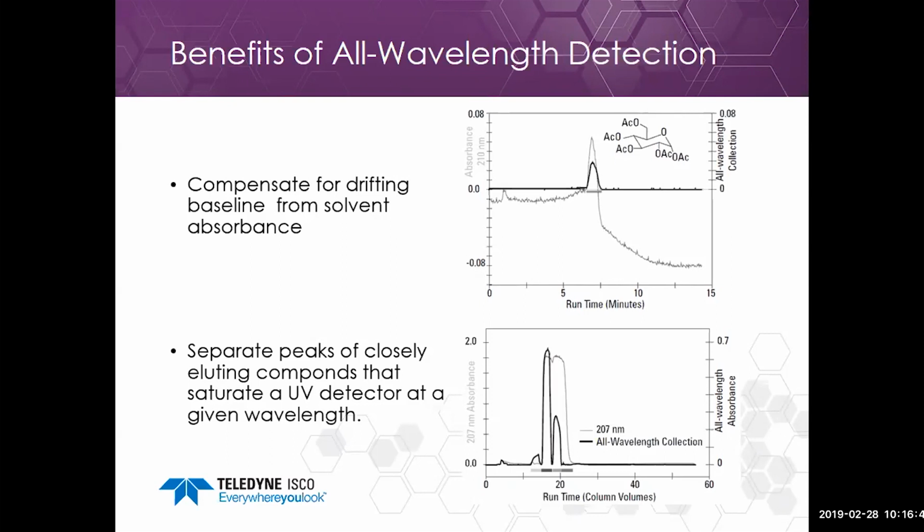That's an additional feature that you can take advantage of to improve your UV and UV-Vis collection settings.